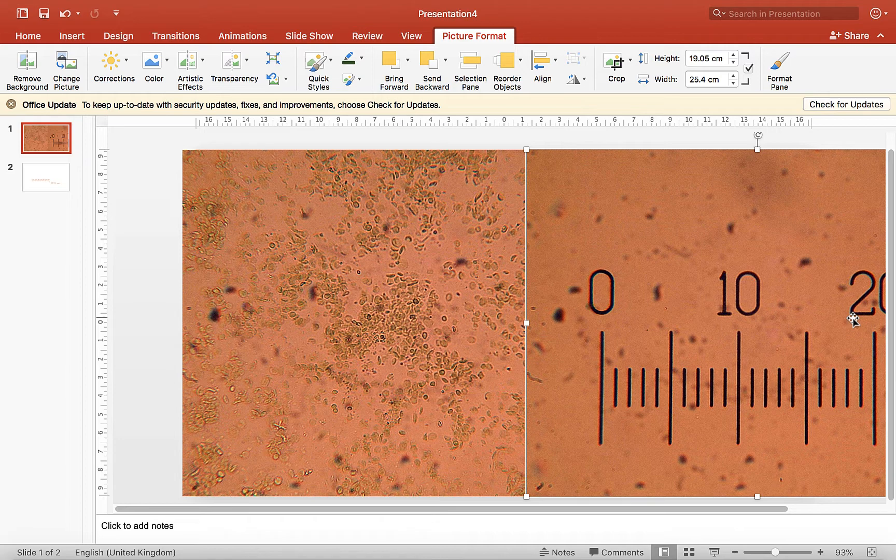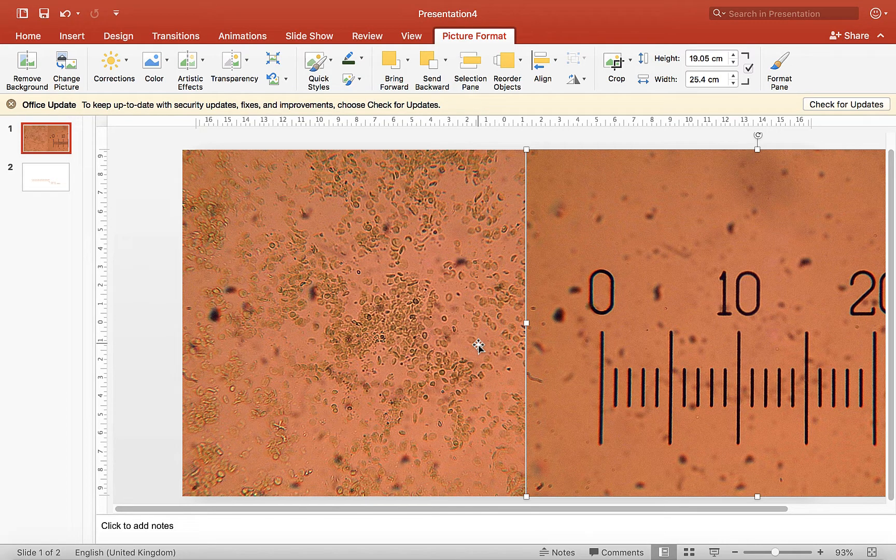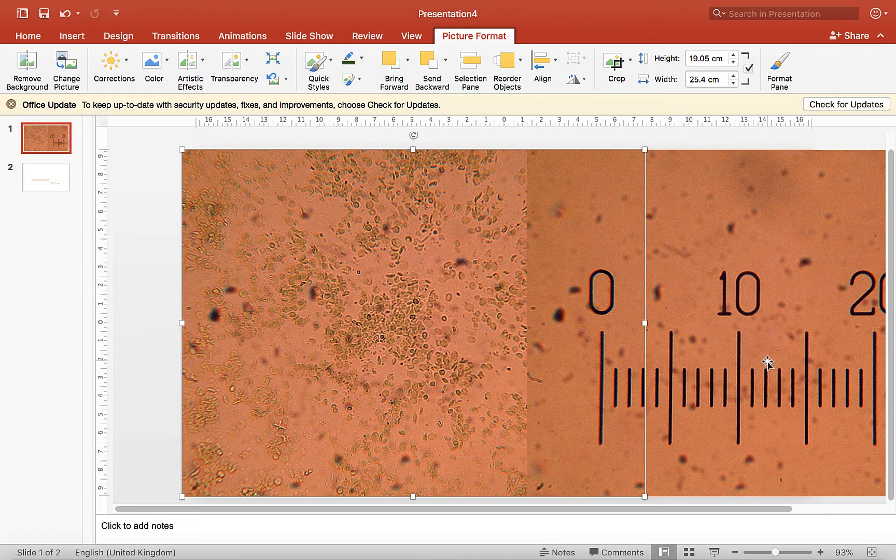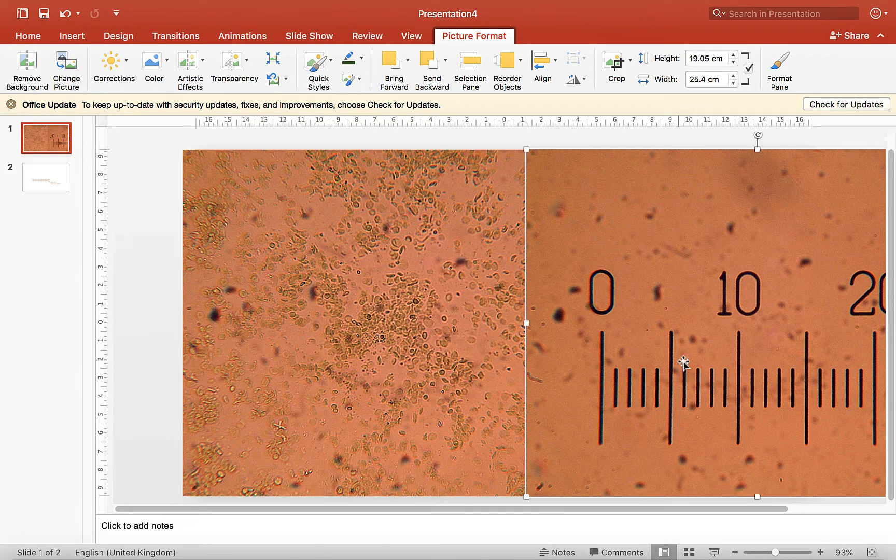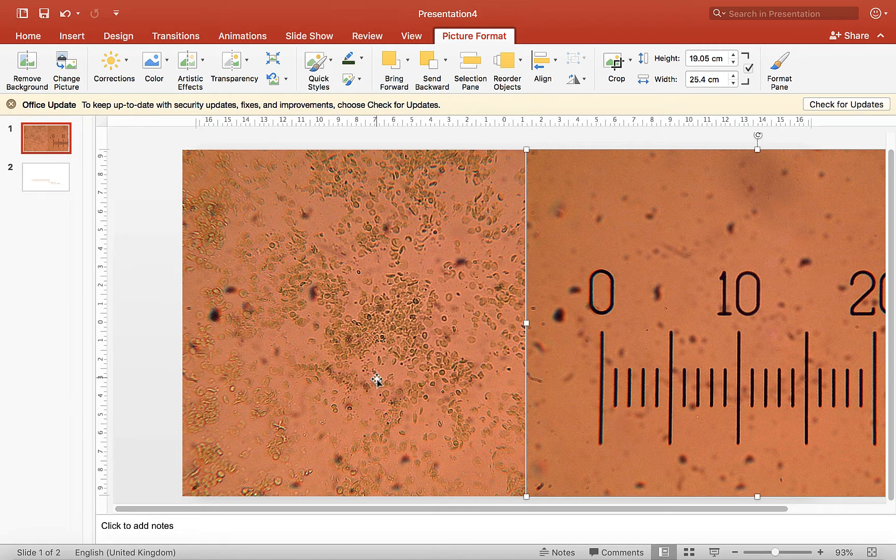A really important thing is that these images were both taken at the same magnification, so at the moment I know that those two images should be directly comparable to each other, so the distances on the right hand image should be the same as the distances on the left hand image.